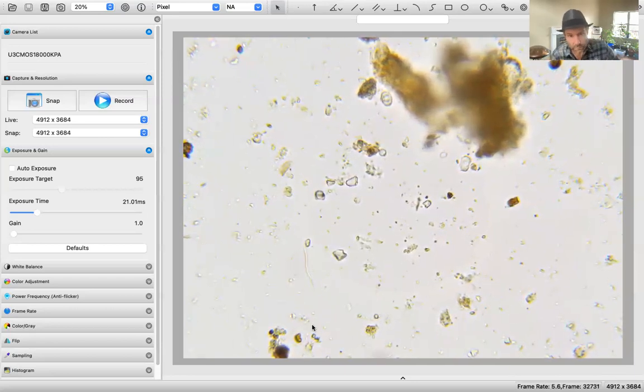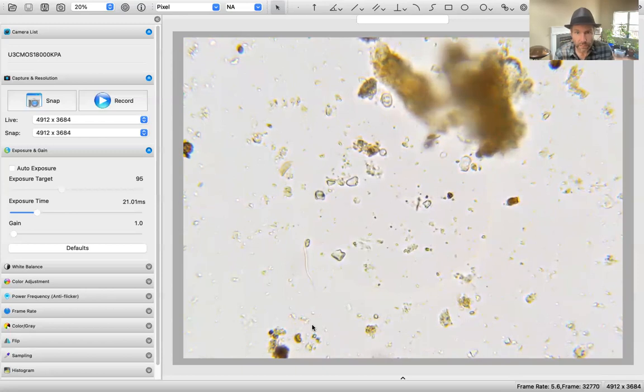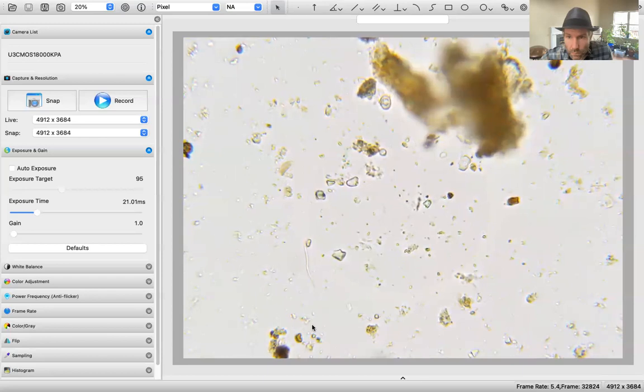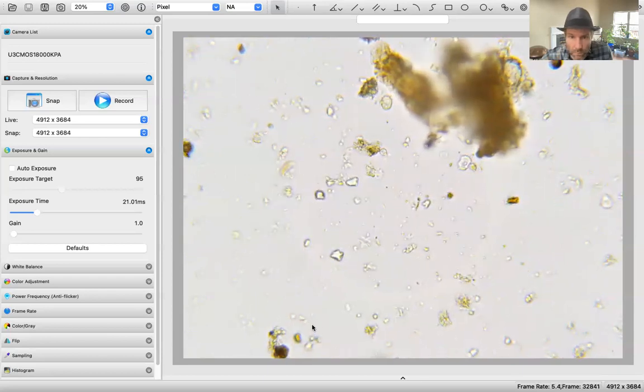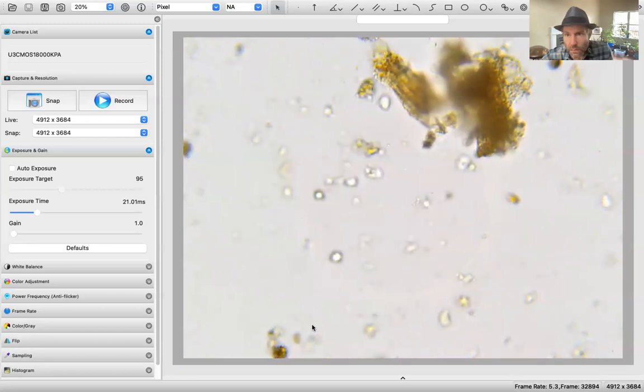I see that actino. Call that a 1 point or 0.125. Looks like a spore next to the organic matter. That is possibly an arcella.